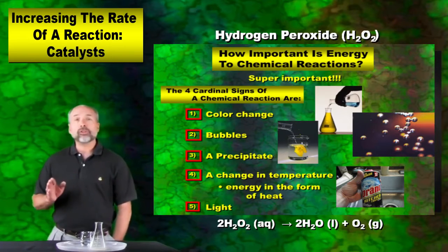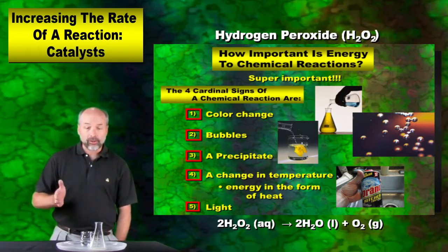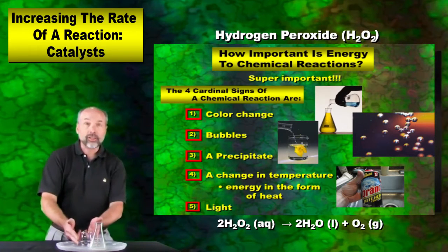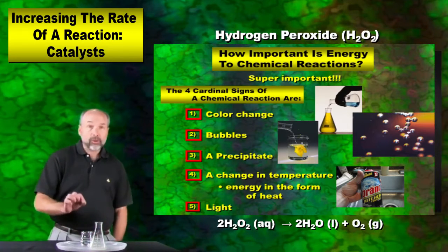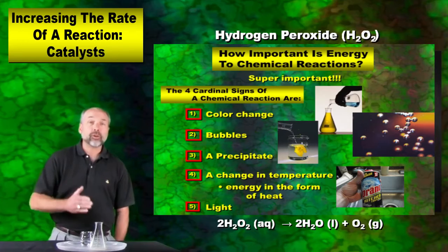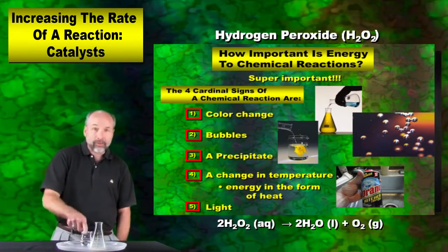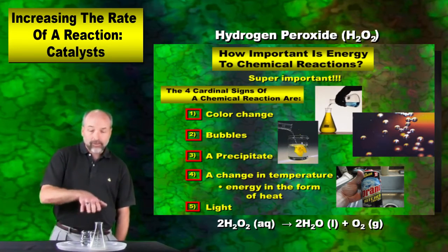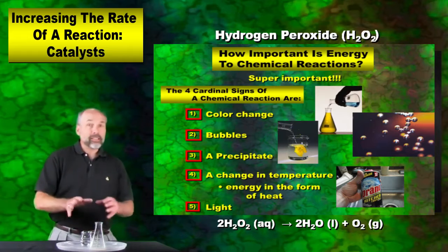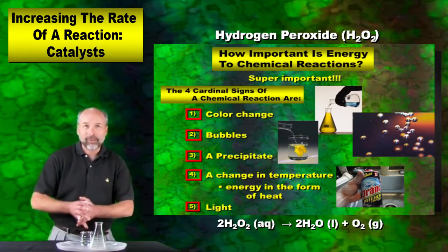But remember, we looked also at thermodynamics, the idea that heat is flowing through chemical reactions. You'll notice if you were to touch this container that it feels cool to the touch. It's room temperature. But if this chemical reaction takes place, it's actually going to release energy. That's an exothermic reaction. And so we can test it before and afterwards and see what really happens here. We also talk about the effects of a precipitate forming. Do we see something coming out of solution? Well, don't expect it to, but we'll see what happens.